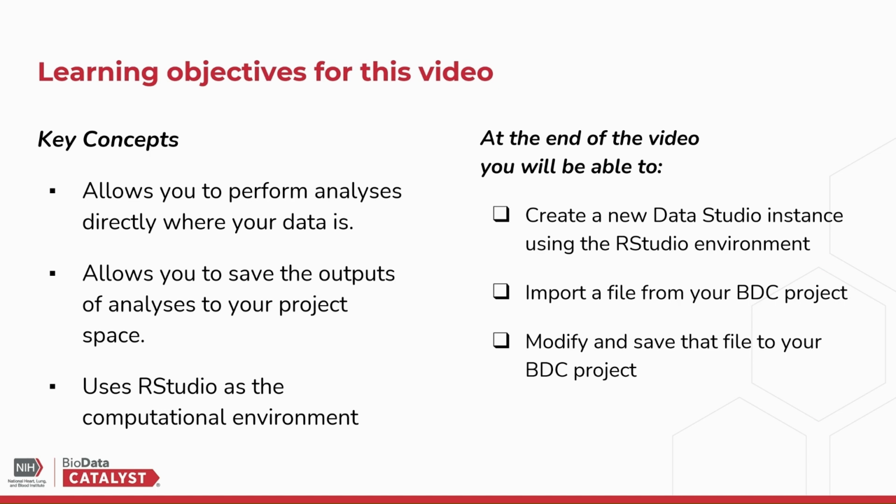At the end of the video, you will be able to create a new Data Studio instance using the RStudio environment, import a file from your BDC project, and then modify and save that file to your BDC project.